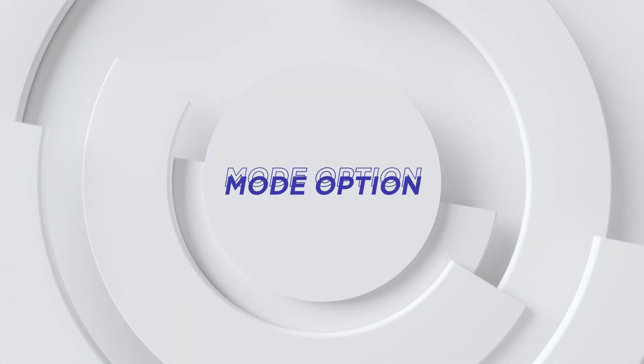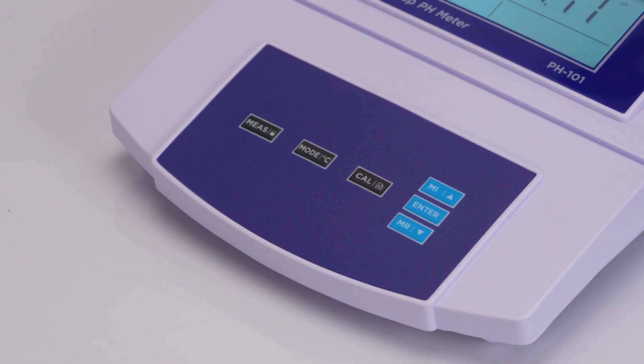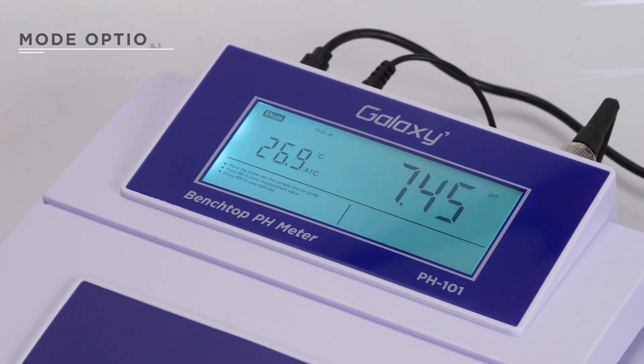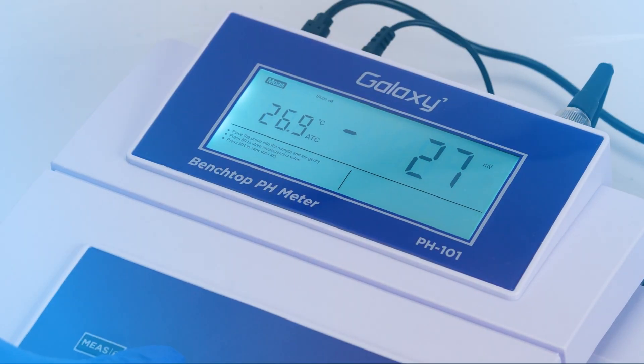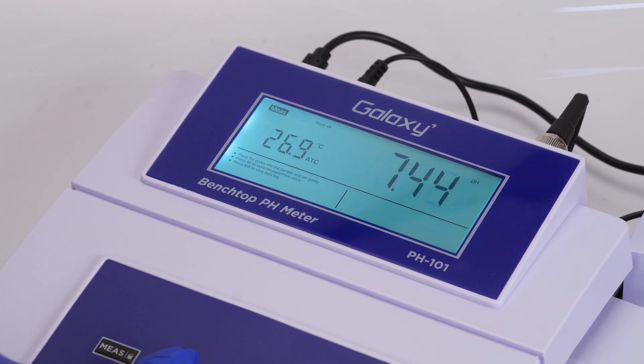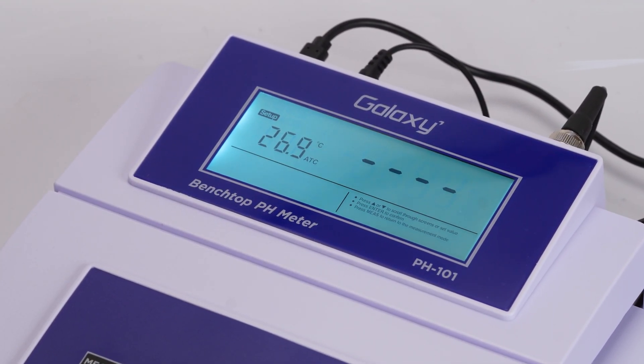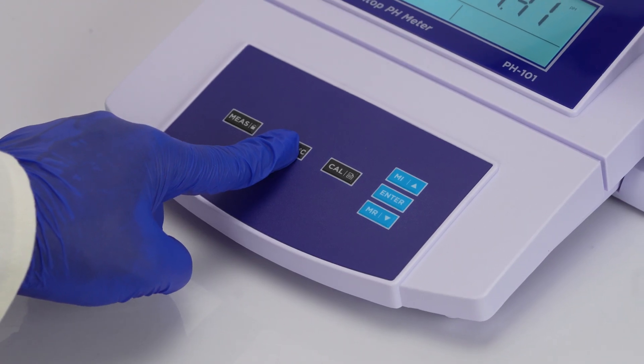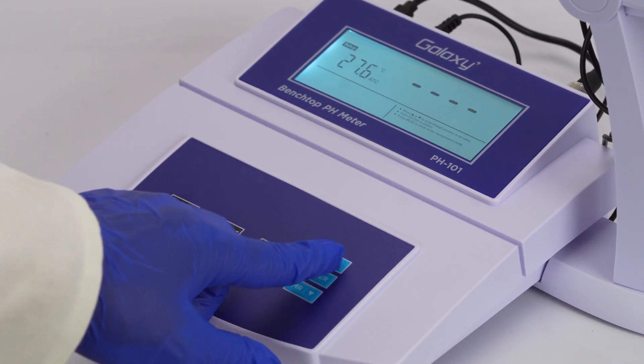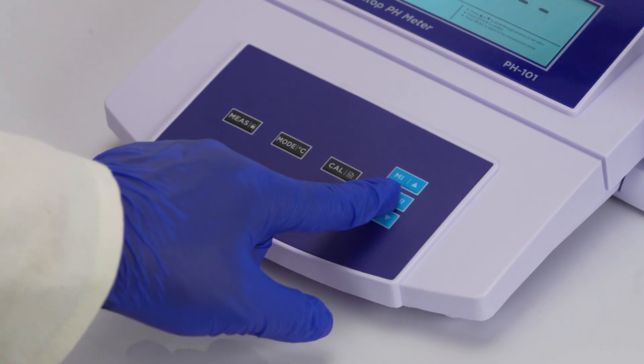Use the mode option to switch between pH and ORP. If the temperature probe is not detected, the meter switches to manual mode. Press and hold the mode key, adjust the temperature with the up and down keys, and press enter to save.